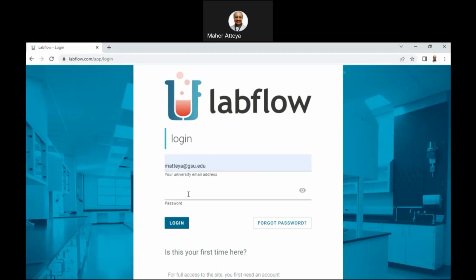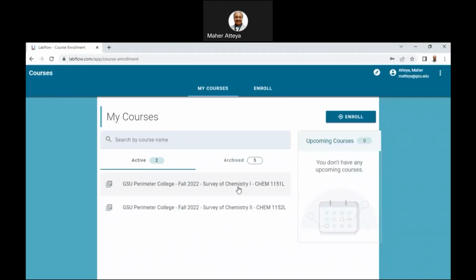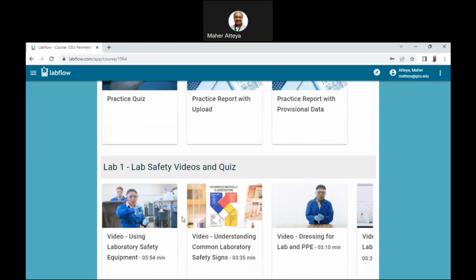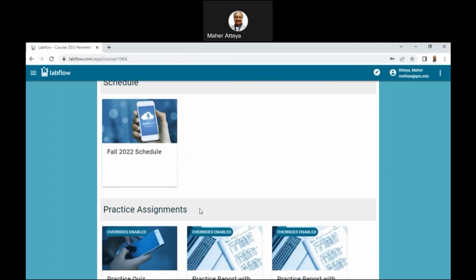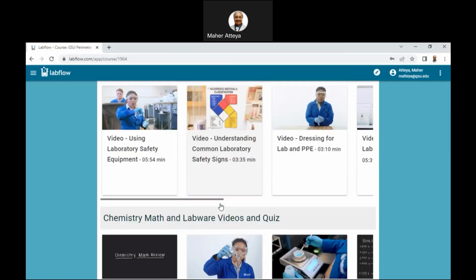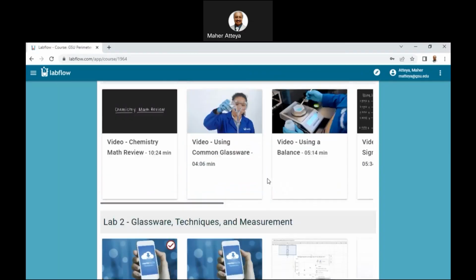This is my email, and then I'm entering my password. I'm logging in. Here are the classes. You see a club, survey of chemistry 1 question, and you can see here all your experiments posted, starting from the schedule of the experiment, practice assignments, lab safety videos, chemistry, math, and lab work videos and quizzes.